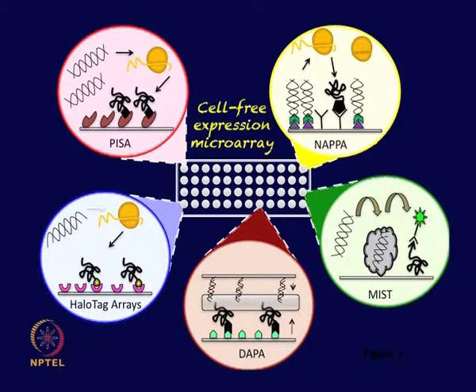In general, protein microarray technology allows the identification and quantification of proteins in a high throughput manner. The recent advances in protein microarray technologies offer unique opportunities to find novel biomarkers as well as apply this platform for several applications. The combination of proteome scale technologies, especially protein microarrays, has the potential to be applied to a wide variety of biological applications.